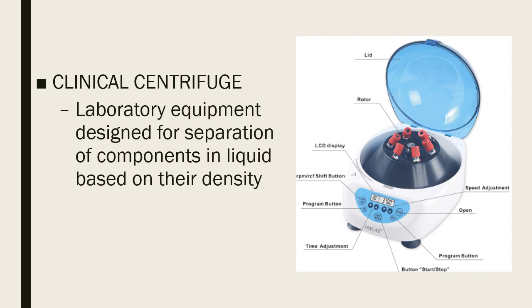Okay, and so of course, please also note the use of the tachometer that is present in your clinical centrifuge. And so in relation to clinical microscopy, this one is used in recovering solid materials from suspensions. An example, of course, is the microscopic exam of your urine.